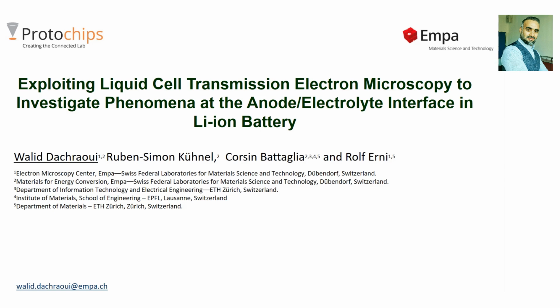Today I would talk to you about the use of liquid cell TEM to investigate phenomena at the anode electrolyte interface in lithium-ion batteries.